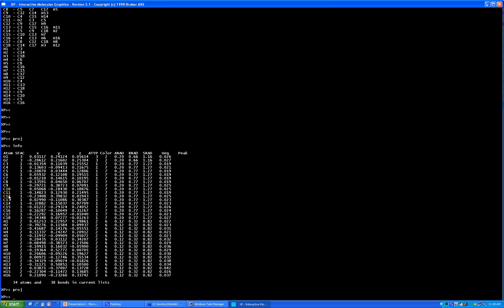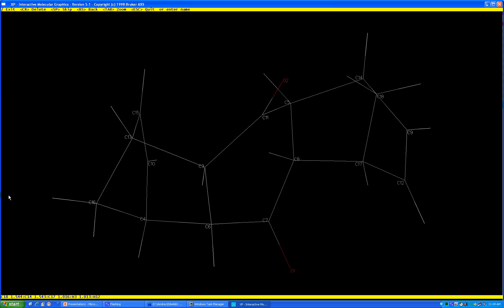The best thing to do is to write out your structure on paper and name the atoms how you want, then enter those names here. To do that, we have the command 'pick.' The pick command allows you to rename atoms, delete atoms, or see where a particular atom is located. Let's start with 'pick dollar carbons,' because the oxygens are already done. If you type 'pick dollar carbon,' it will rename only carbon atoms, and you can see it flashing one carbon atom at a time, asking how you want to rename it.